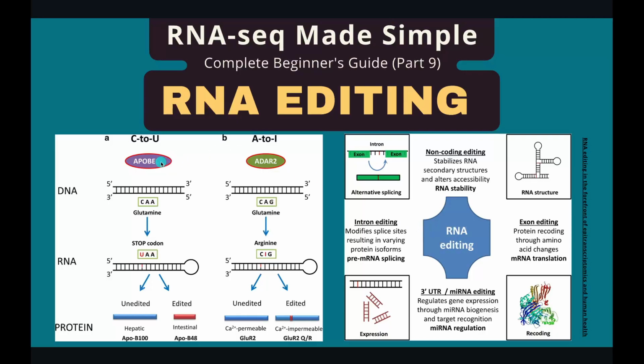For example, it can change C to U or A to I in an RNA sequence directly. And depending on where it occurs, RNA editing can either change protein sequences when it occurs in coding sequence, or regulate gene expression when it's found in non-coding sequence. Our job in this tutorial is to detect such events.